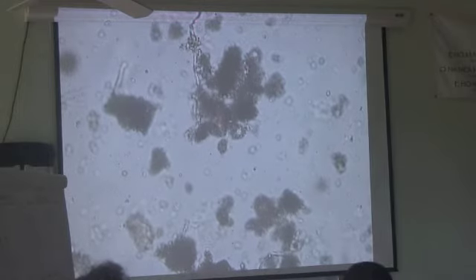We've got to decide, is that a fungal hypha or are those actinobacteria? When I'm in focus on them, I can't see space between. So I would put a strand of actinobacteria because I think that's pretty much the same critter. So here's another one, another strand. So we've got another actino. We've got a little bit of something here, but actino at best. Flagellate. See him right there? Bouncing around, so now we would record one flagellate in this field. We've really got to focus in on them and decide what diameter. This is not looking good, is it? No. So we've got another actinobacteria.